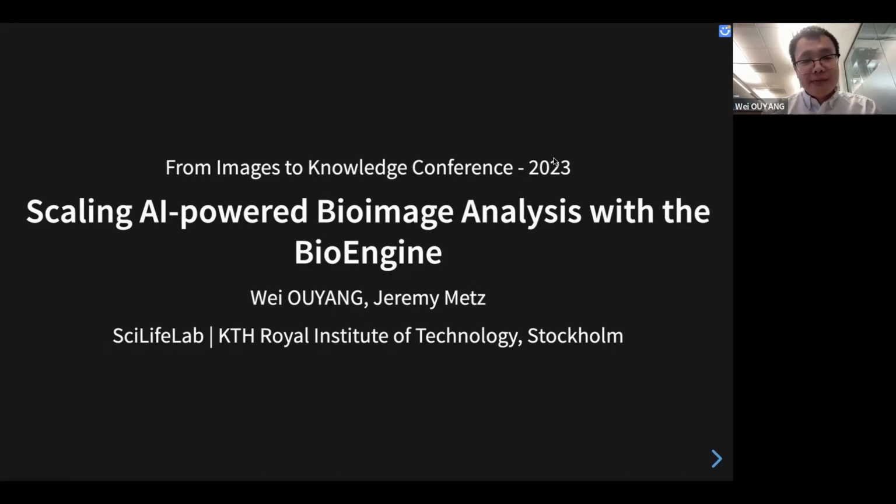Today I'm mainly going to introduce some work we have been doing recently. It is a platform for scalable bioimage analysis called BioEngine. This work is part of the AI for Life consortium supported by the EU. We have been working on this for quite a while with the larger community within the Bioimage Model Zoo, if you have heard about it, but I'm going to talk about it later on. So today we're going to introduce this platform.